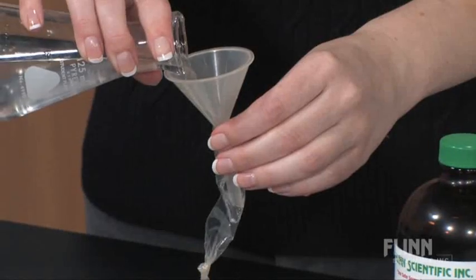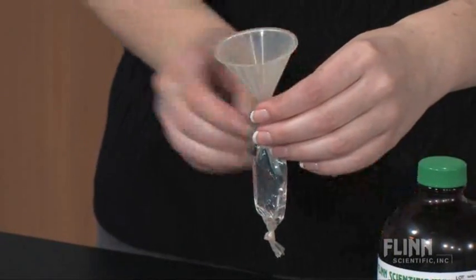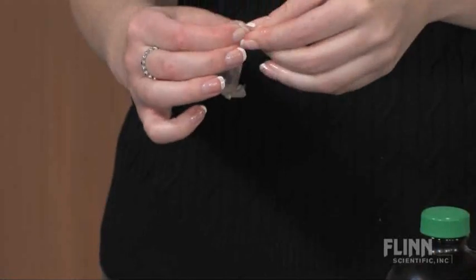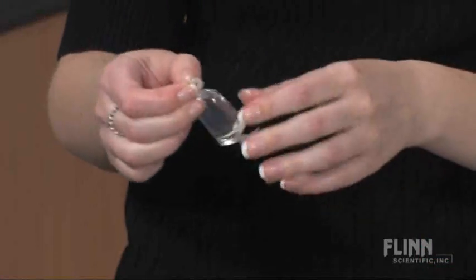We then fill a piece of dialysis tubing, which is tied at one end, with the starch solution. Then close the other end of the bag by tying it shut, but try to leave as little air as possible.